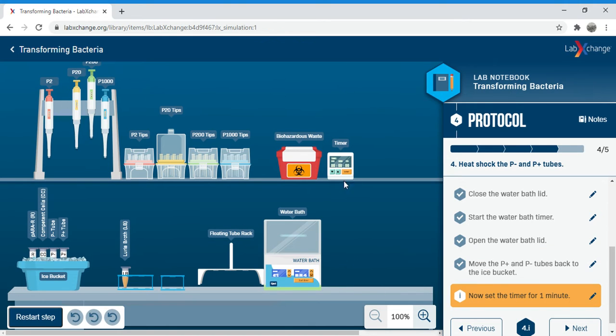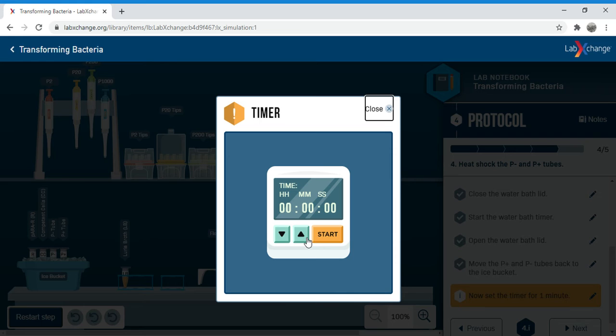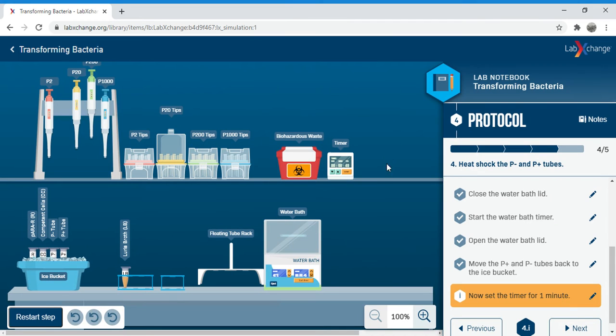Now we set the timer for 1 minute. Okay, set. Okay, start. Let's wait for 1 minute to pass. That was my knuckles. I cracked my knuckles.